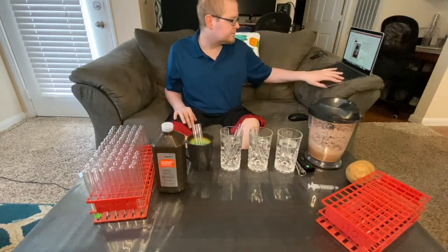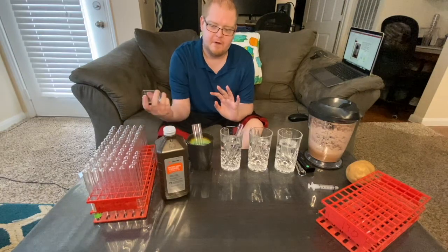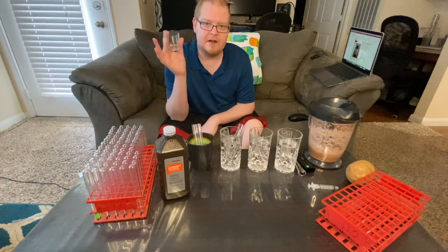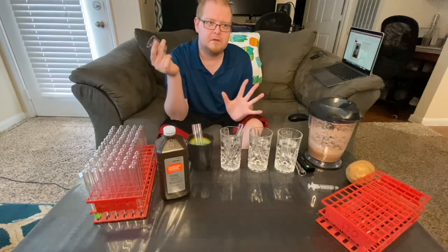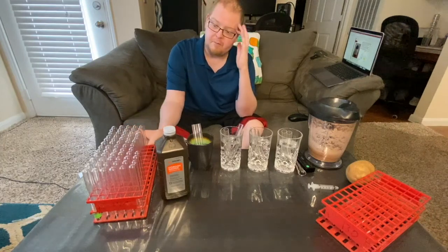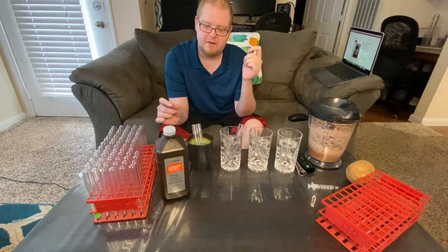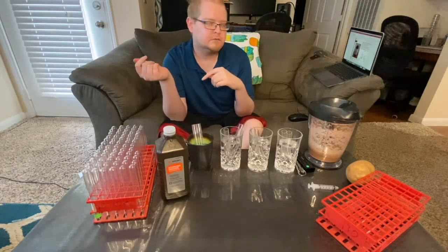Catalase reacts with hydrogen peroxide and is going to bubble up a lot in these test tubes. Keep in mind that I'm not going to require you to have test tubes. You can use shot glasses, or tall glasses that have a funneled top. Just use something that has a large enough top so that when it bubbles, it's not going to bubble over.